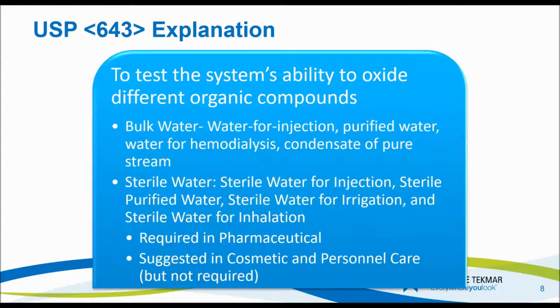Like I said, there's 2 levels now to it. There's a bulk water level, which represents water for injection, purified water, water for hemodialysis, condensate of pure stream. There's also a sterile water, which represents sterile water for injection, sterile purified water, sterile water for irrigation, and sterile water for inhalation. It's required to do system suitability testing for pharmaceutical industry.